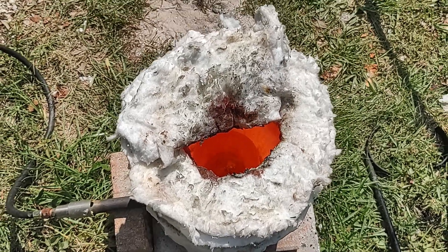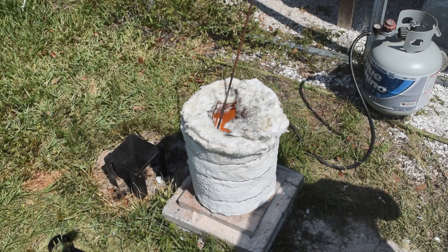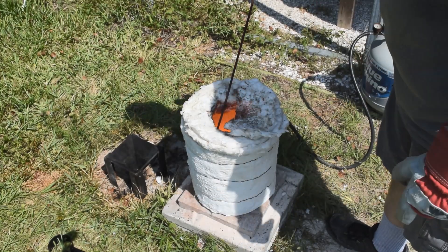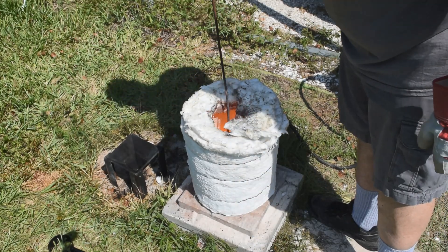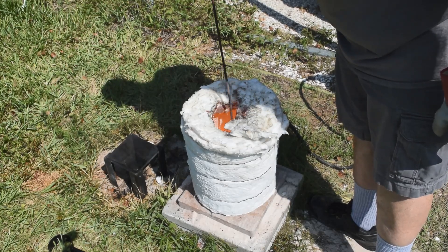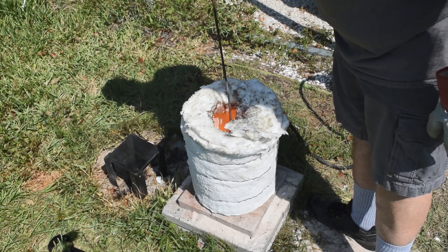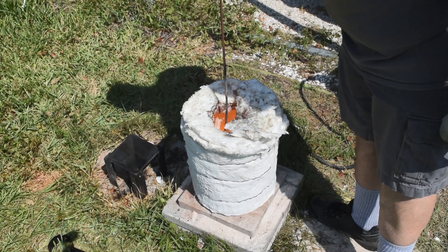We're getting to where everything's looking pretty molten. I don't know if it's showing up on camera — see that stuff? I think that's tin, I really think that's tin floating on top there. I've had my iron rod in here for a little while to preheat it so everything doesn't freeze out on it when I stir. That slag's pretty low viscosity. I think we're about ready to pour. Maybe we'll get some tin out of this — that'd be nice.